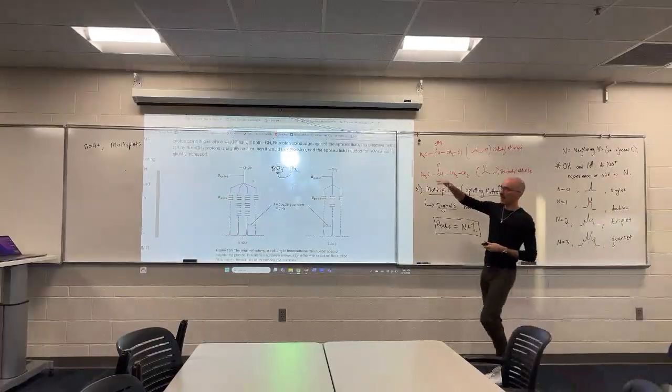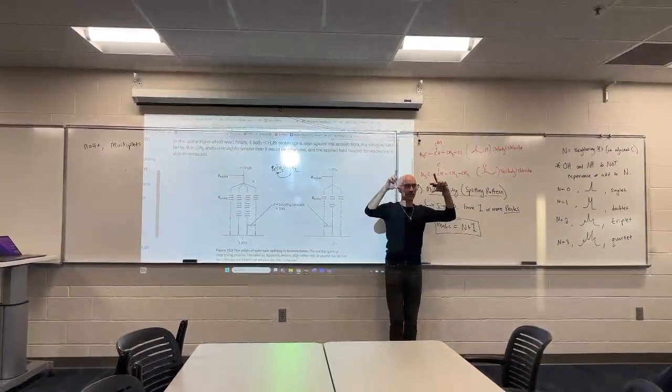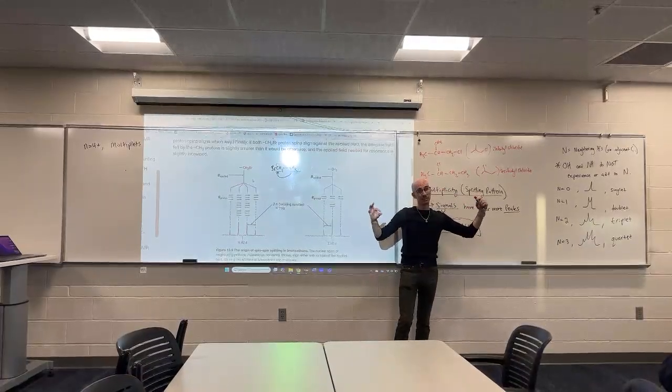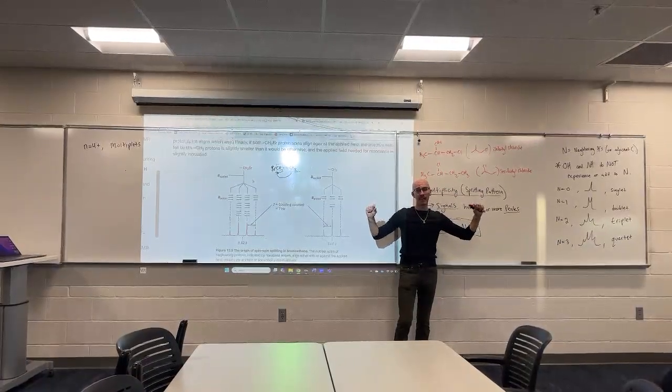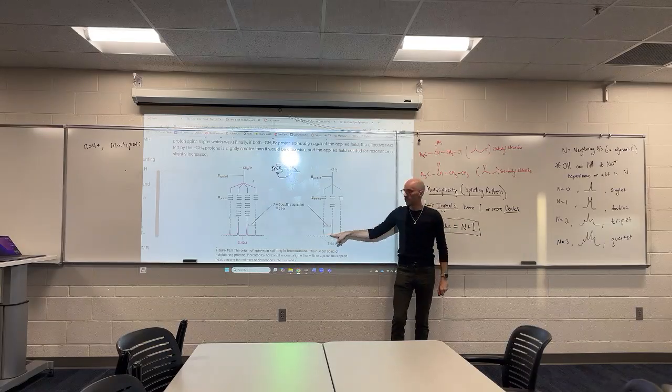But with increasing peaks, these exterior signals get smaller and smaller and smaller until, to a certain point, your magnet might not actually be strong enough to even pick up on that signal. It gets really hard to even see that it's there. This is splitting pattern. It is the shape of the signals.